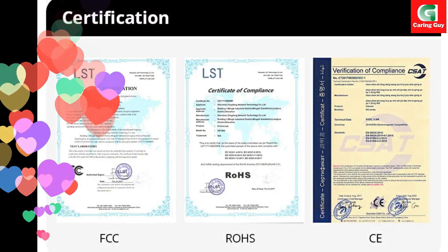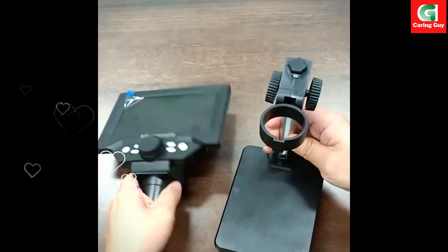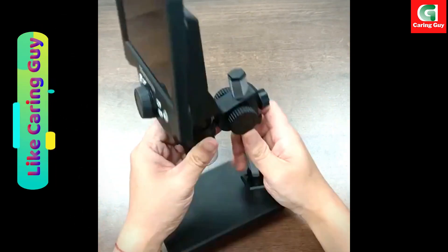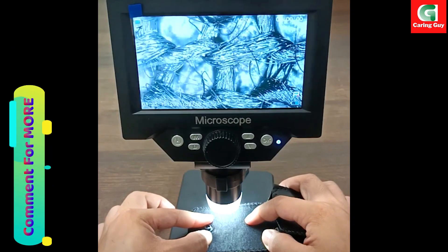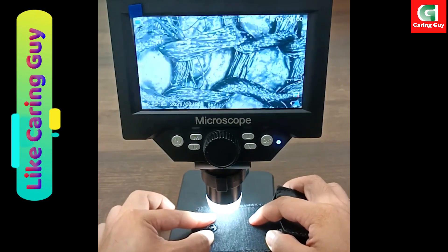In conclusion, the 5.5-inch LCD digital microscope stands as a versatile, durable, and user-friendly tool with advanced features, making it an indispensable instrument for various applications and a great addition to anyone's tool kit.